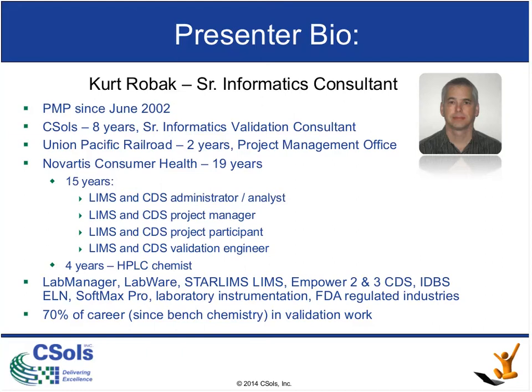The second to last bullet point shows some of the systems that I have extensive skills or have experience validating. A lot of LIMS systems, chromatography systems, laboratory notebooks, plate readers, instrumentation. And I would estimate that through my career, about 70% of it has been involved in validation in one way or the other.